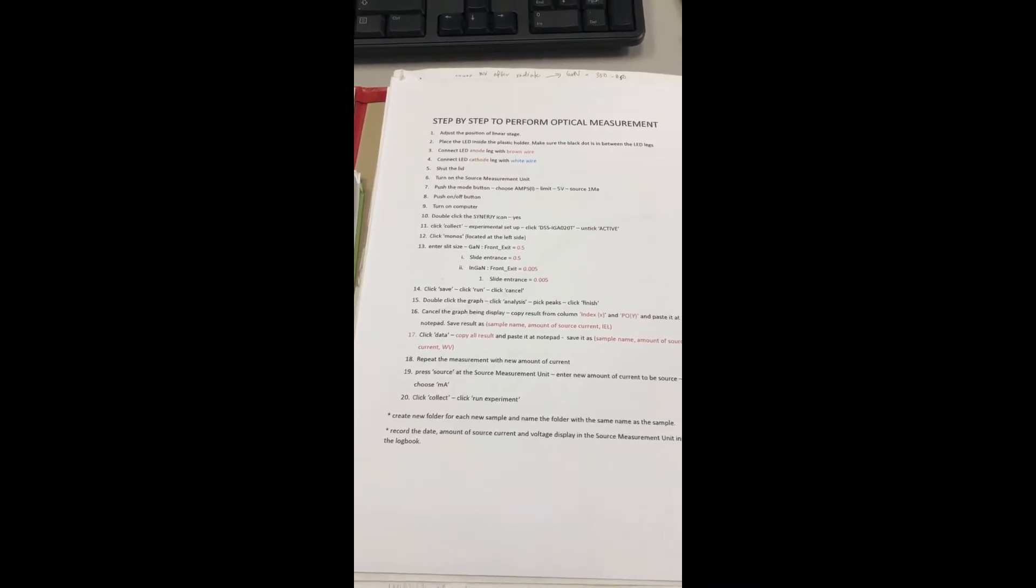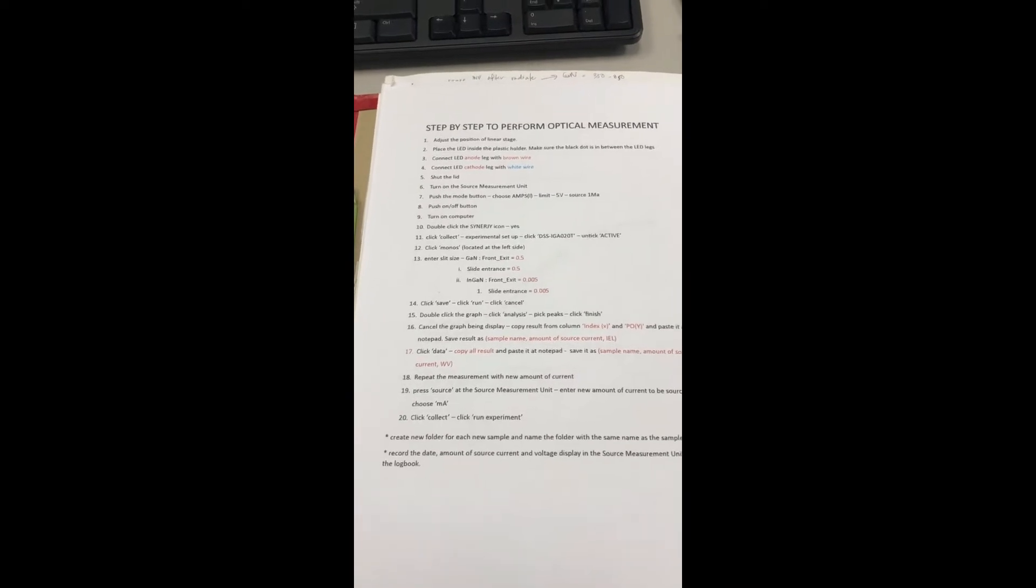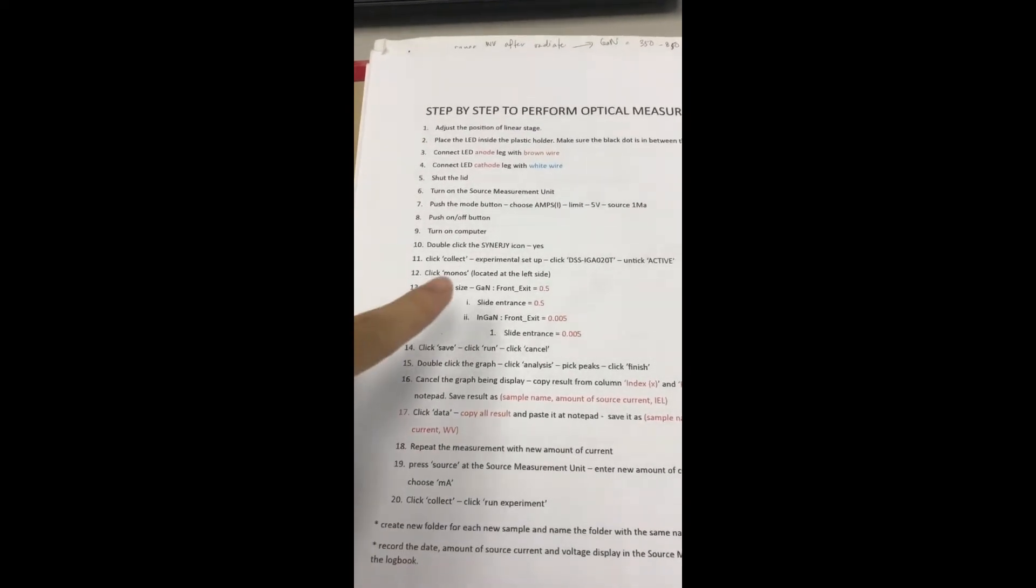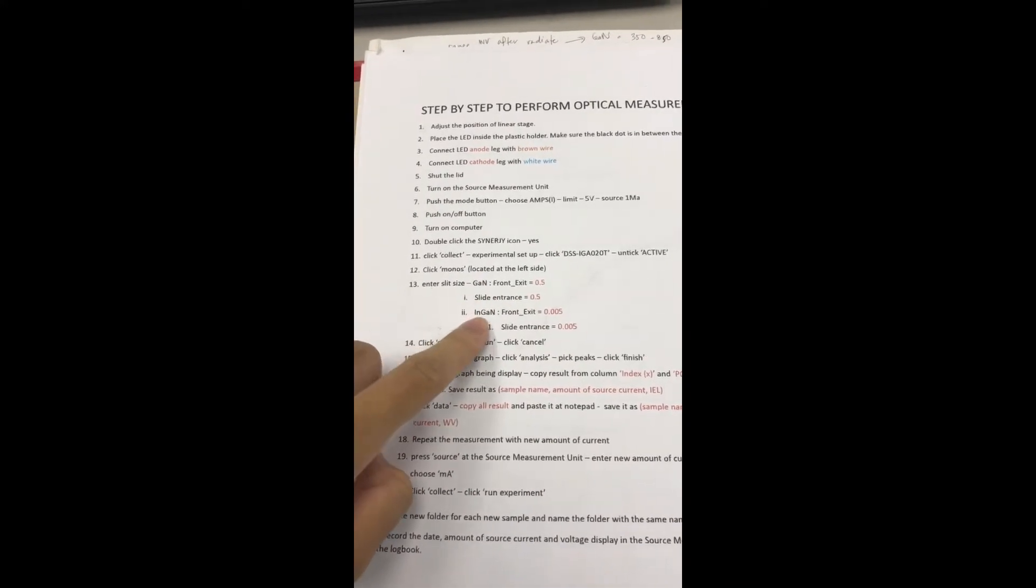Today we are going to perform the optical measurement for an InGaN LED. You need to make sure if you are using GaN, you need to set up the Horiba machine with 0.5 the slit, and InGaN is with 0.005.